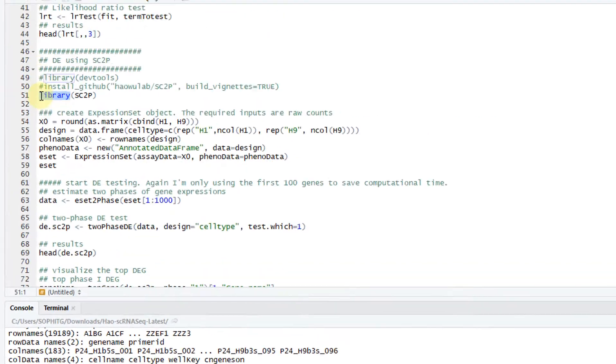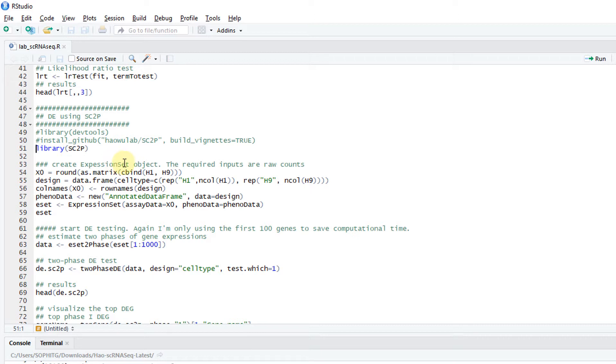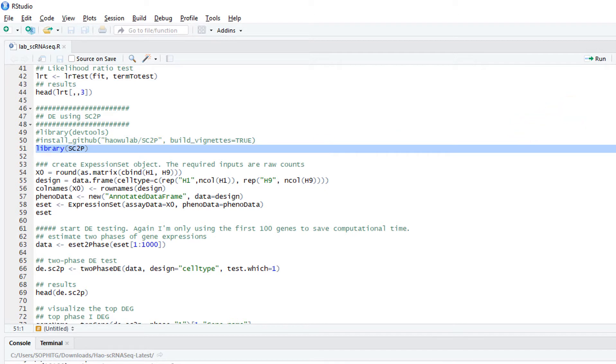I want to introduce another software called SC2P. It's actually developed by me and my colleagues. We have the software on GitHub. You have to install from GitHub. But we are in the process of submitting it to Bioconductor, so it should be on Bioconductor very soon. After installation, you load it in.